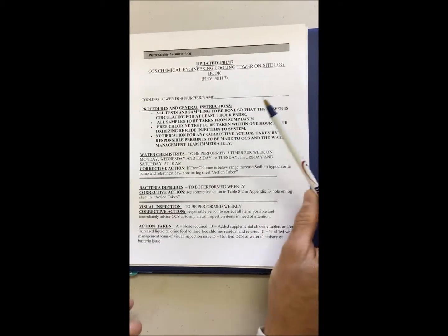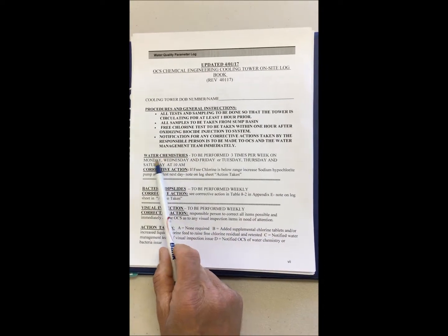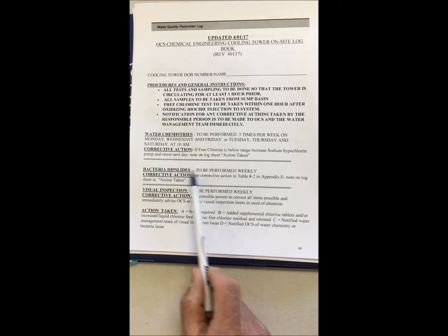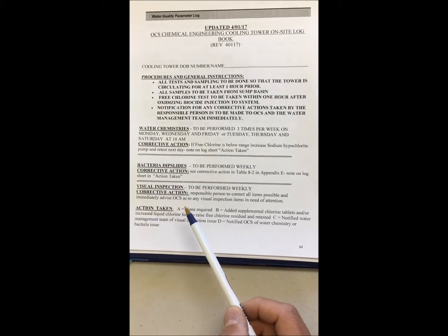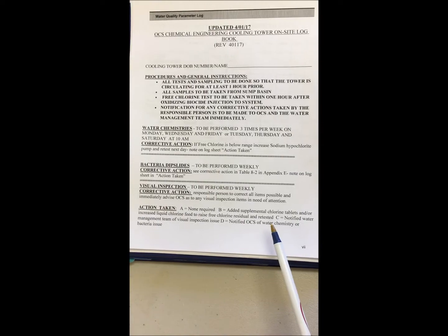And this log sheet gives you all the things you need to know: where you take the test from, at what time you take it during the day, how long the water is going to circulate before you take it, and so on and so forth. It notes, as I told you before, the water chemistries are performed 3 times a week and any corrective action needed. It tells you about the bacteria dip slides, and again, to be performed weekly and any correction needed. And lastly, the visual inspection and any corrective action needed. And the key down here, A, B, C, or D, is where you note that corrective action.